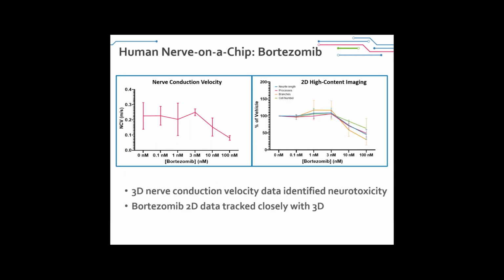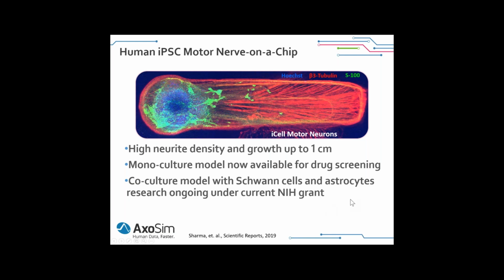And this myelination data is something that we just published, and there's a lot more information in there than I necessarily shared here. But we have seen, again, physiologically relevant myelin in our human-on-human system. And as far as we are aware, this is some of, if not the first publication that shows this really compact, mature human-on-human myelination. A lot of people have done combinations of either rat Schwann cells and human neurons or vice versa, but we were able to do this with a fully human system.